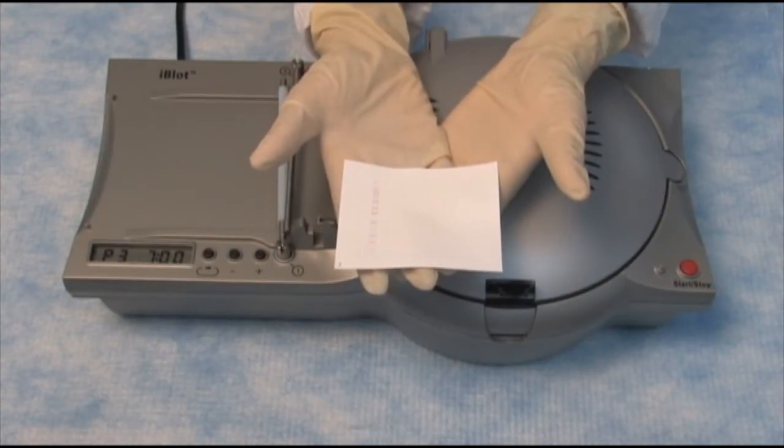We've just completed transferring proteins using the iBlot. You can see the pre-stain standard on the membrane, and we can now move on to western processing using either the BenchPro 4100 Western processing station or the iBlot Western detection kits.